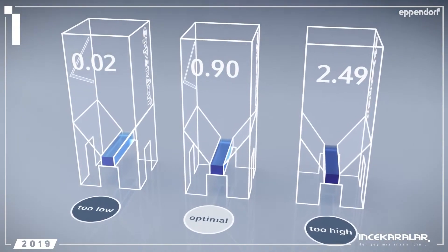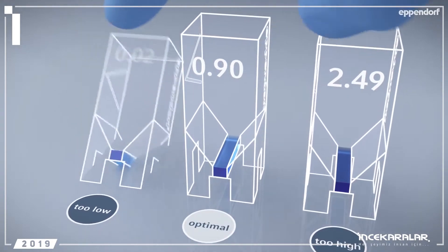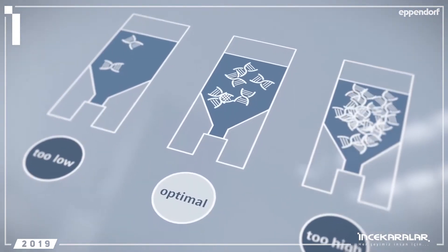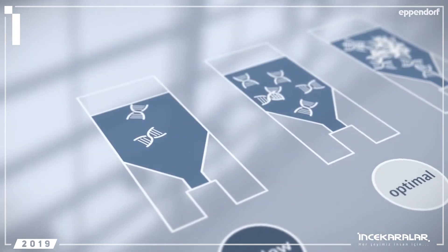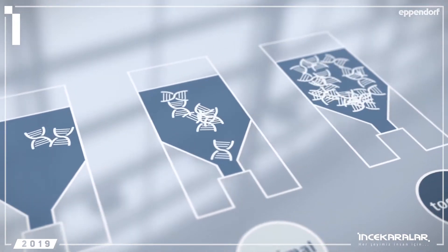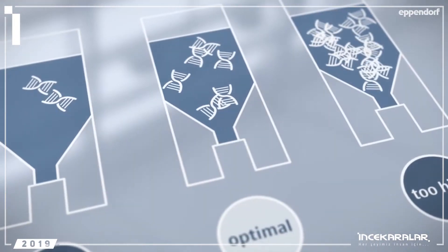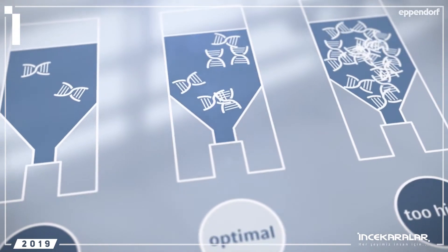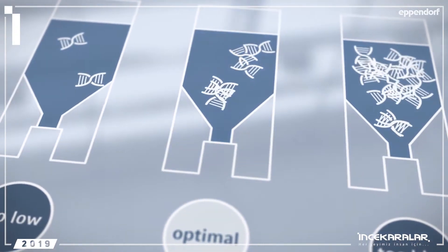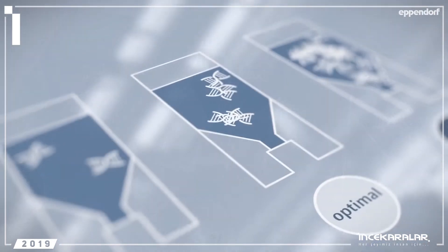But a very high DNA concentration can also cause problems. DNA can bind to magnesium, reducing enzyme activity in the process. In addition, you may not have enough matches with both primers binding to the same strand of DNA. And just as important, a lot of DNA can also mean a lot of inhibitors coming from your extraction. This all leads to inferior results.